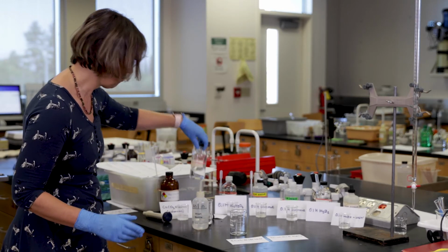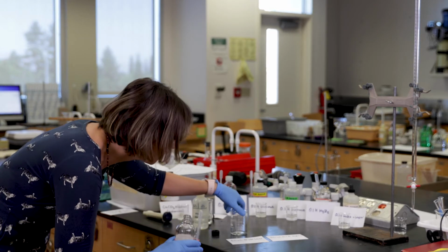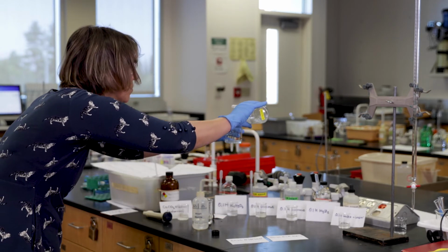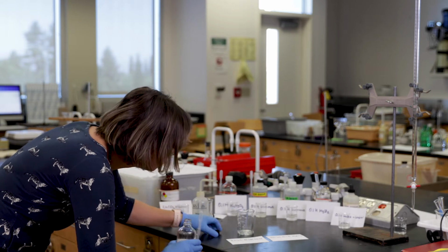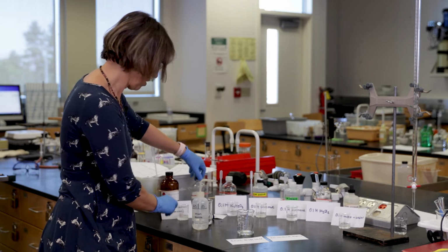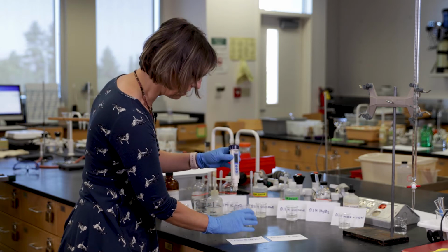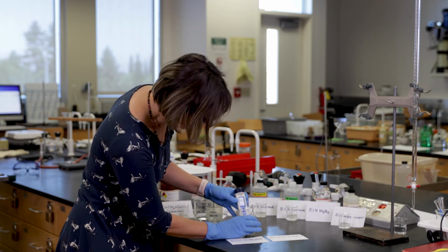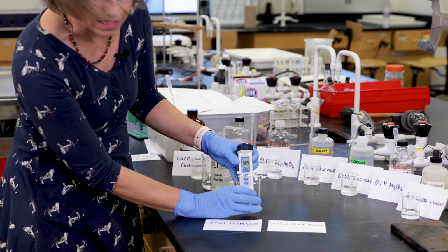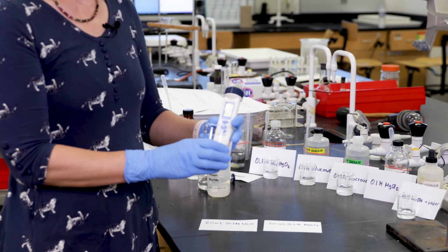So we start with 20 milliliters of the sodium chloride solution. That's a clean glass. We just add 20 milliliters. It's about here. We already measured that concentration solution in the previous example, but let's just repeat that measurement. It's at 9.89 millisiemens.